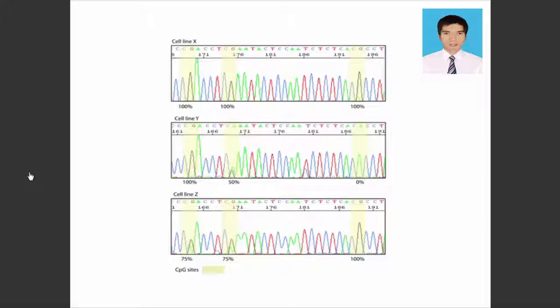Cell line X displays 100% methylation at all three CpG sites, whereas cell lines Y and Z show varying degrees of methylation, as seen by overlapping G-A signals.